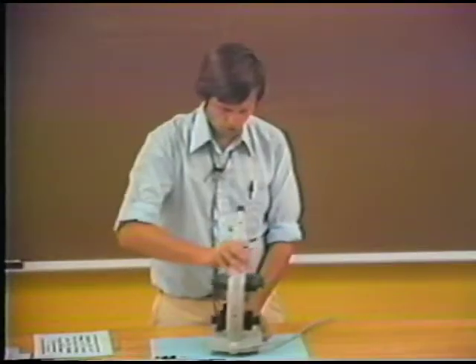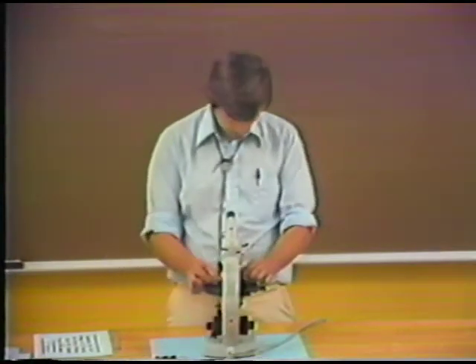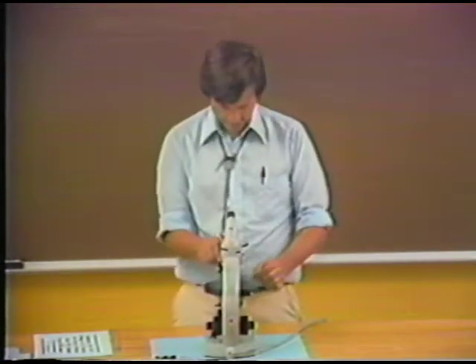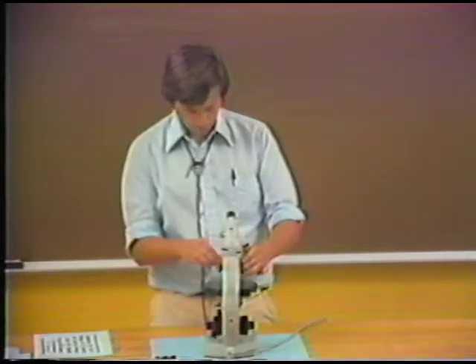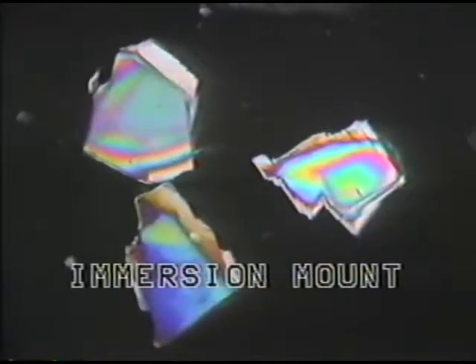Okay, well, I'm going to just take a quick look at an immersion mount here for you and show you our typical sort of setup. So I've prepared an immersion mount, and we'll just take a look at this mount now first in plain polarized light, and now with the polars crossed, so you can see these individual mineral grains.